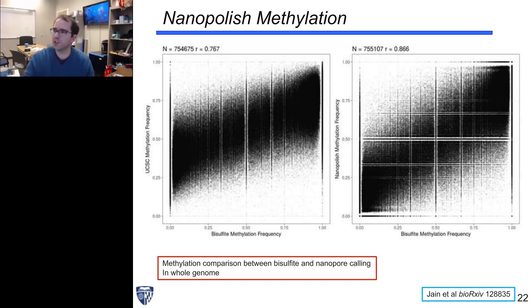This was part of a consortia where they just threw a lot of sequencing at that sample to get relatively deep sequencing. And you can see that we correlate really well. When we get the deeper sequencing levels, our correlation is quite good with the conventional bisulfite sequencing data.